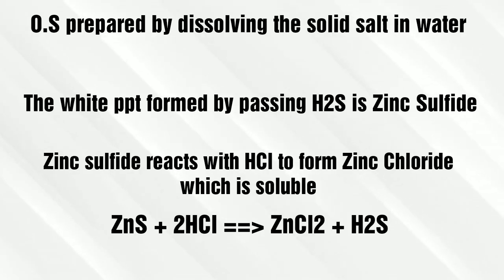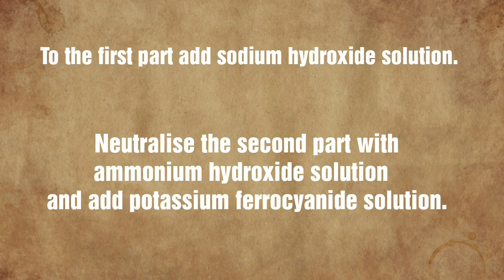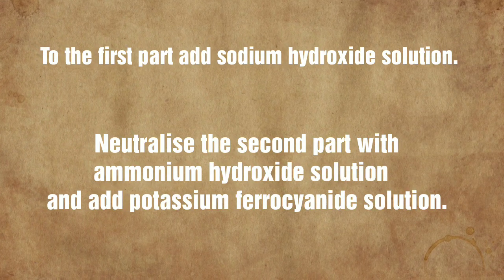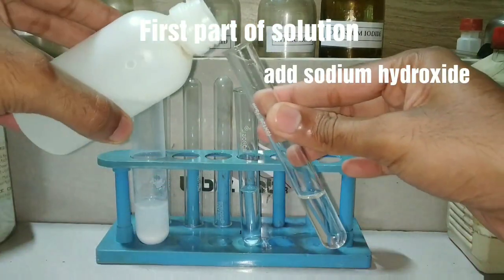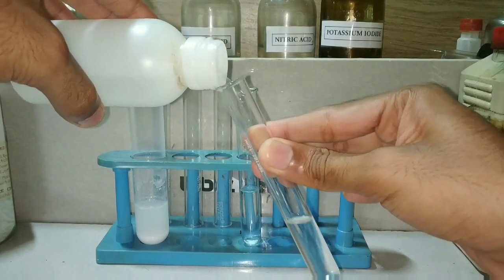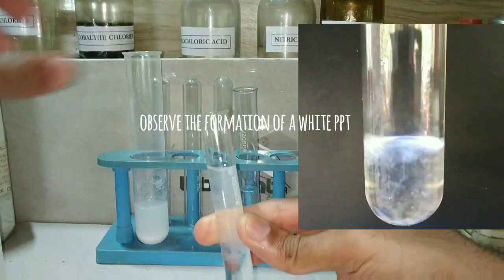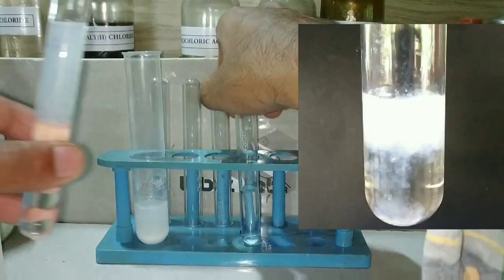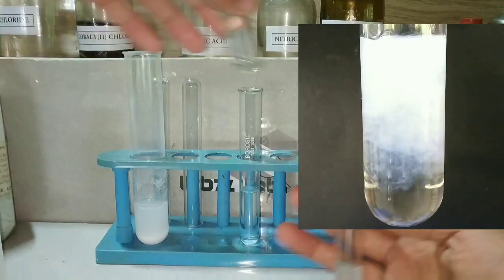The white precipitate formed was zinc sulfide, and zinc sulfide reacted with the hydrochloric acid forming zinc chloride, which is soluble in water. Now that we have dissolved the precipitate, we divide the solution into two parts. To the first part we will be adding sodium hydroxide, and to the second part we add potassium ferrocyanide. Here I have taken the first part and I am adding the sodium hydroxide solution. Initially there is no reaction because the added sodium hydroxide reacts with the already present hydrochloric acid. After that reaction, a white precipitate starts to form.